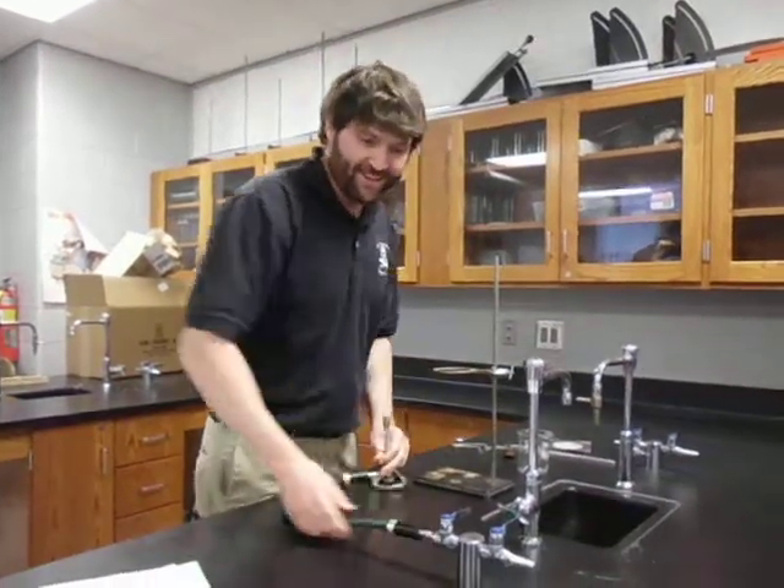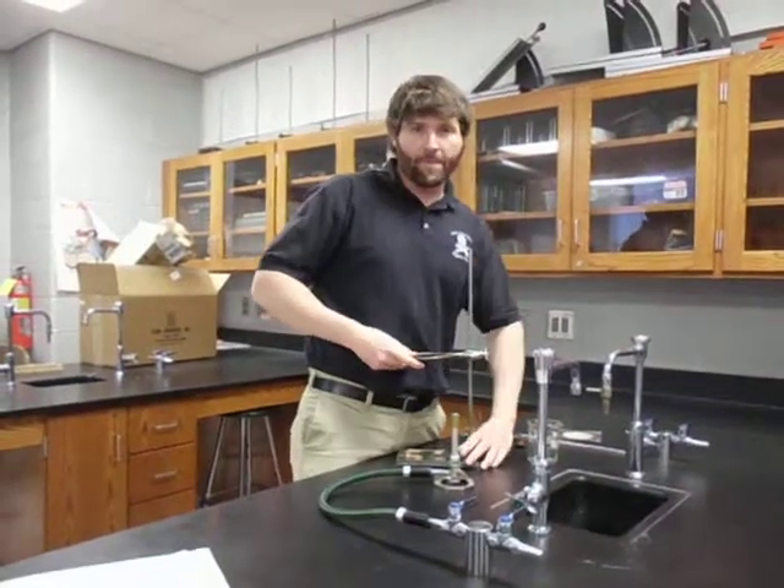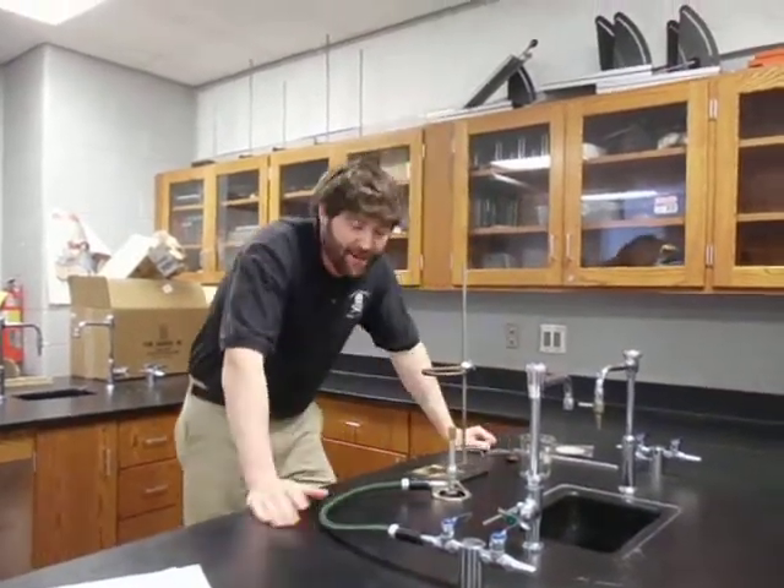Welcome back to chemistry class. Today's lab we're going to do is a Charles Law lab. The whole purpose of this lab is that we're going to attempt to measure absolute zero.